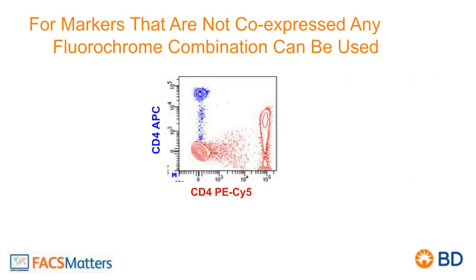One thing I want to make a point of, and this is something I keep hearing from people, is, oh, I can't use these two dyes together in my panel. And the answer is no. You can use, as far as I can conceive of, virtually any two dyes, as long as they aren't actually measured in the exact same detector. Any two dyes you can use in a panel. You just have to be careful where you use them.